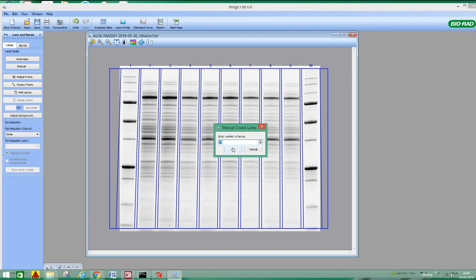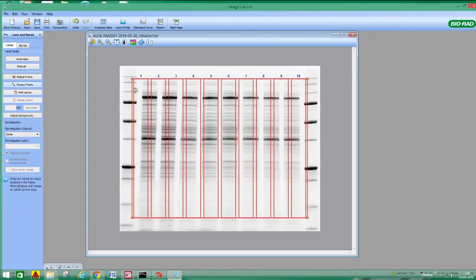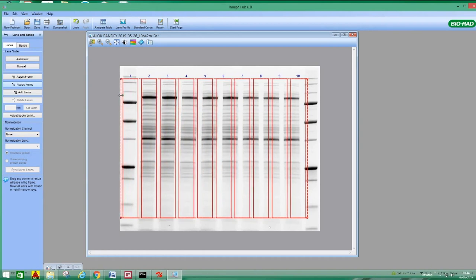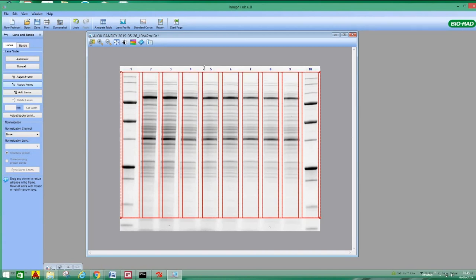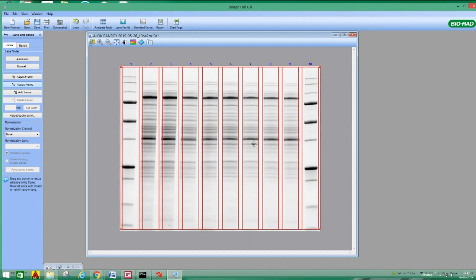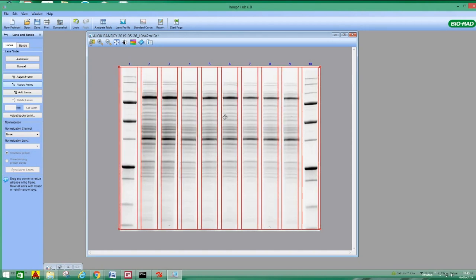Suppose you want to do it manually, enter the number of lanes, how many lanes are there? 10. So here you can adjust lanes. See, this is not fitting completely, so you have to adjust like this to get complete lanes. Now you can see the lanes are completely adjusted and fitted in. So this is another way, the manual way.